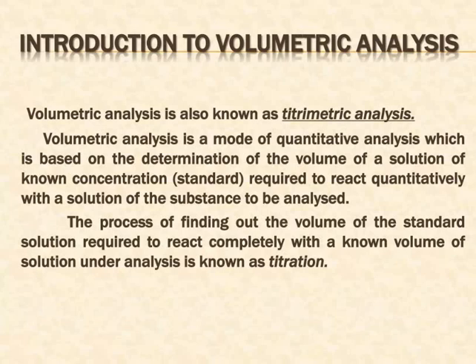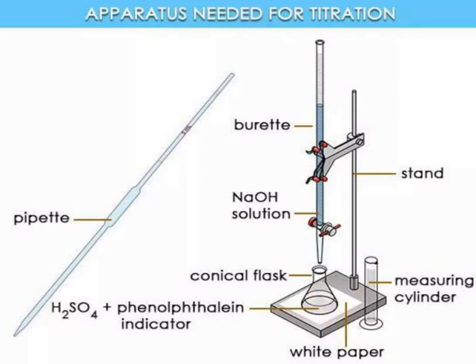The process of finding out the volume of the standard solution required to react completely with a known volume of the solution under analysis is known as titration. So look at here, the apparatus needed for the titration, and this is very important for the laboratory.